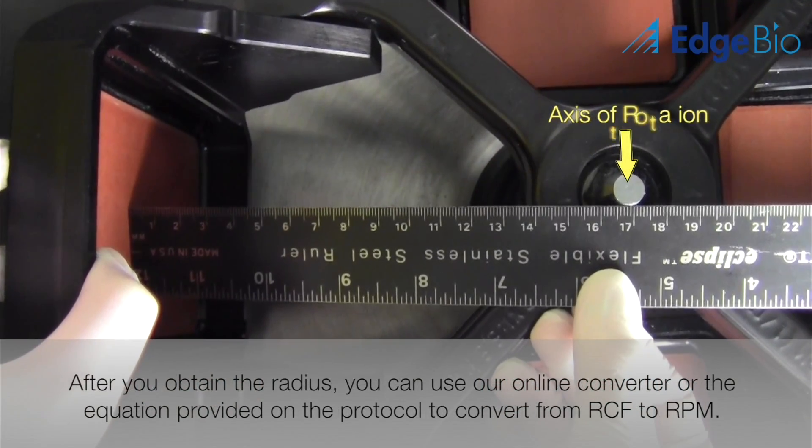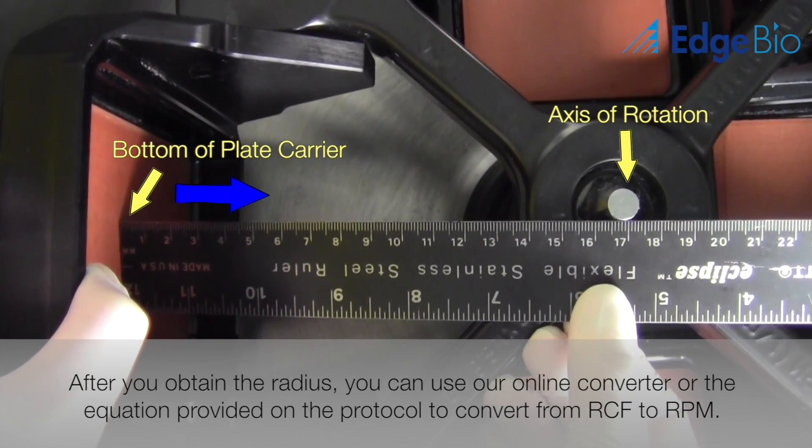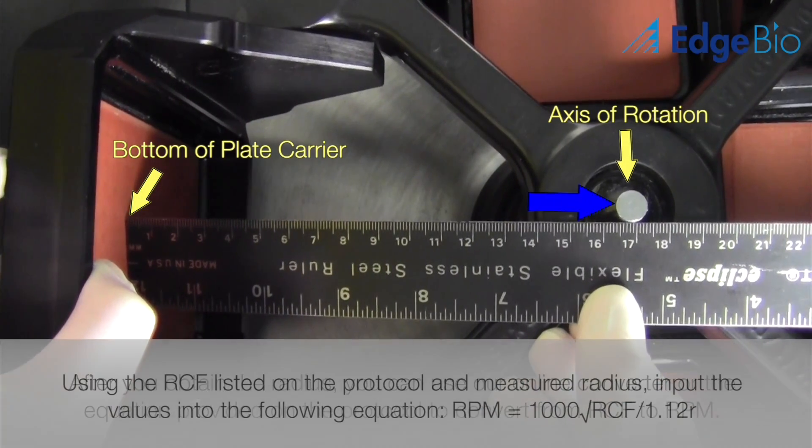After the radius is measured, there are two ways to carry out the conversion. Using the equation that is provided on the product summary sheet, simply input the measured radius and carry out the conversion.